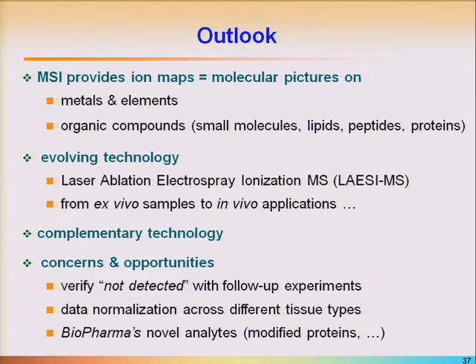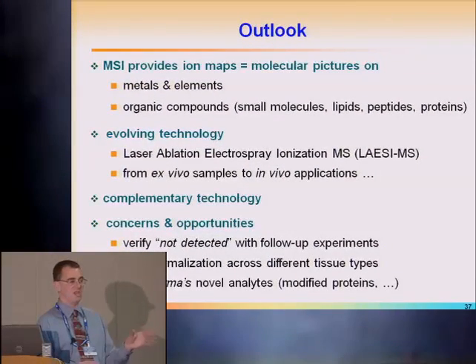As for concerns and opportunities, in my lab we have to verify not-detected results with follow-up experiments. There are some analytes that will not work by imaging. We had some examples where we saw some protein binding and the drug would not extract, but it's a very easy test. You just take your sample, put your drug of interest on top and analyze it an hour later, and if you cannot detect it, it just doesn't work. So there are some analytes where imaging doesn't work.